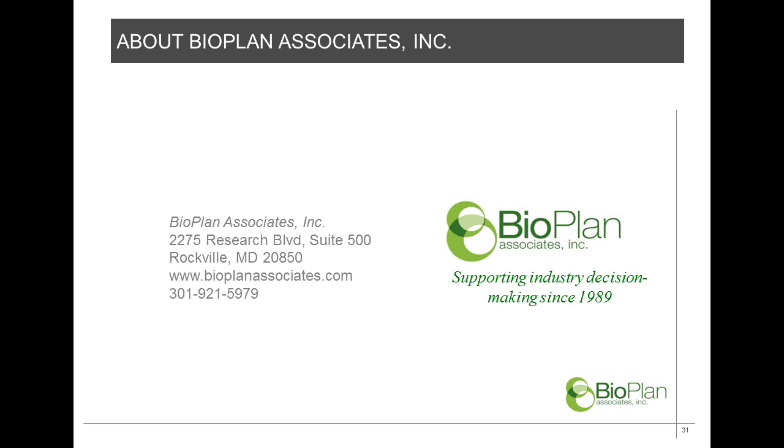Yeah, I was wondering, in the model that you used, what method were they using? Well, remember we talked with a lot of people, and typically, that's an interesting question: were they using a media kitchen or an inline buffer dilution system or formulation? Those are all very good questions, and therein lie some of the problems when you're trying to develop a model.